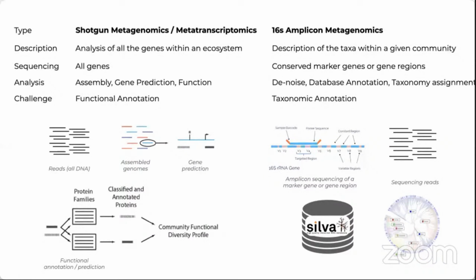This 16S sequencing is a technique that is widely used to study a microbiome directly in its environment, and this will focus on either, as I already mentioned, 16S or 18S ribosomal RNA that has to be amplified using PCR amplification before getting quantified and matched onto the database of known 16S rRNA sequences. So these sequences contain hypervariable regions and variable regions that provide species-specific signature sequences that are extremely useful and are used to identify bacteria and their taxonomic ranks.